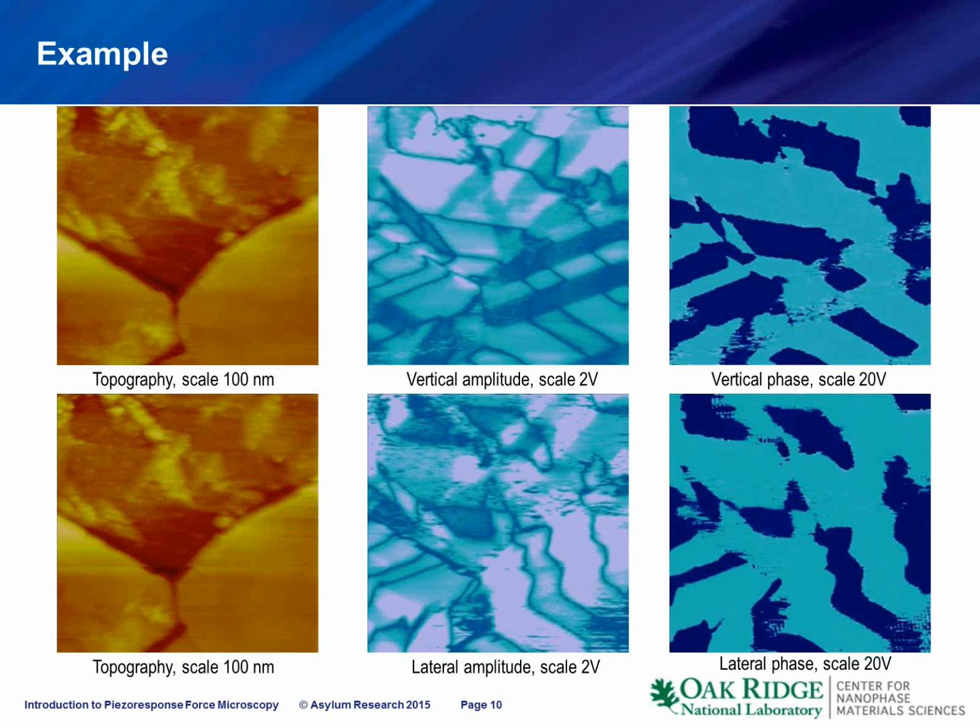Notice that we can get both vertical and lateral signal, and this data is complementary. So there is clear correspondence between the vertical and lateral images, but the information is different. So you see the domain walls in both of those images, but the signal at which a domain manifests is totally different.